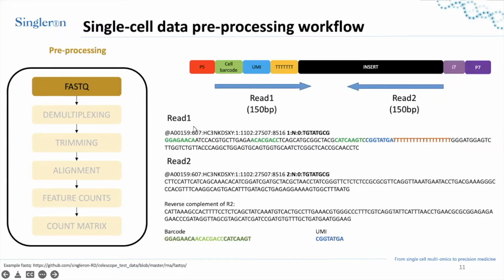So this is our read 1 in the R1 Fastq file. And this is our read 2. So we can see it actually forms a pair. So we searched for this read in both of the Fastq files, in R1 as well as in R2.